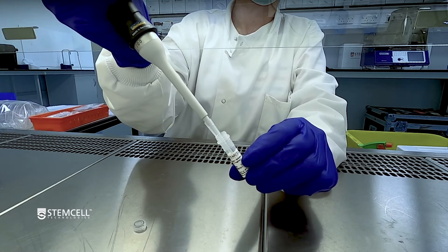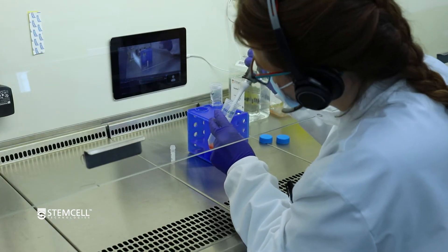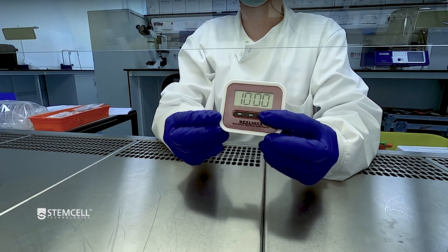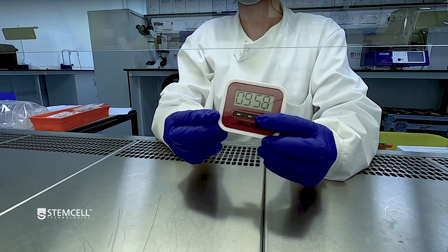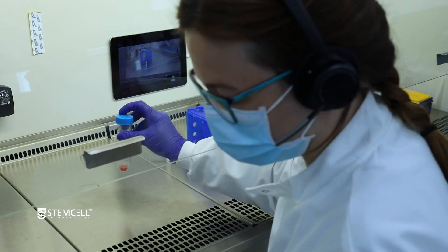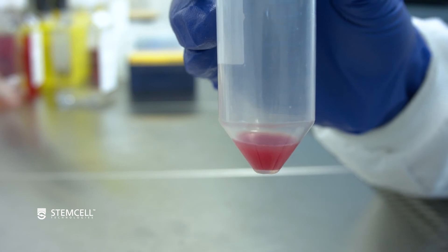Next, add DNase-1 solution to a final concentration of 100 micrograms per milliliter and incubate at room temperature for 10 minutes. This step is optional and you can refer to the product information sheet for your specific EasySep kit for guidance. Following the incubation, you will have a single cell suspension that is ready for cell counting and downstream dendritic cell isolation.